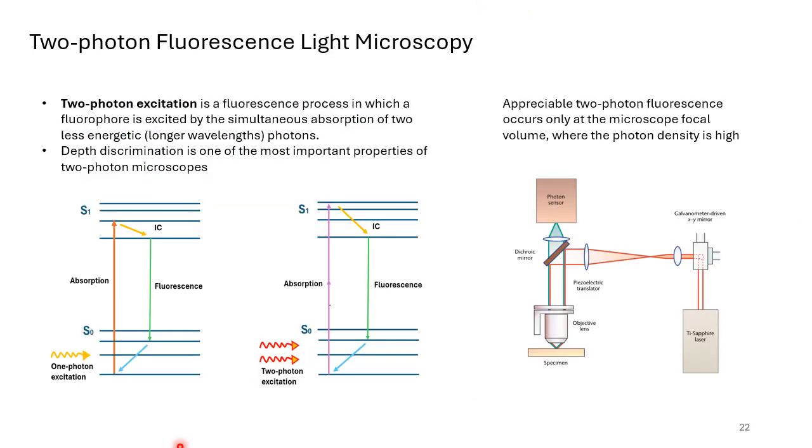In the conventional confocal, the optical slicing ability is achieved by a pinhole that works as a spatial filter by blocking the fluorescent light that comes from out of the focus, which I have already talked about. However, the specimen is illuminated not only in the region of the focus but also in the entire double cone region extending above and below the focus. These shortcomings are overcome in two-photon microscopy.